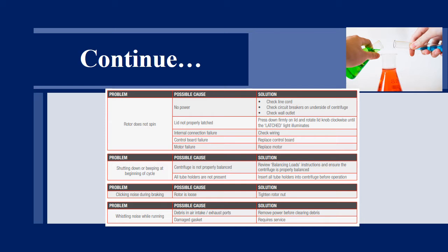Fourth problem is shutting down or beeping at the beginning of the cycle. The possible cause is the centrifuge is not properly balanced, review balancing loads. Shutting down or beeping at the beginning of the cycle can occur when all tube holders are not present on the rotor of the centrifuge. Insert all tube holders into centrifuge before operation.